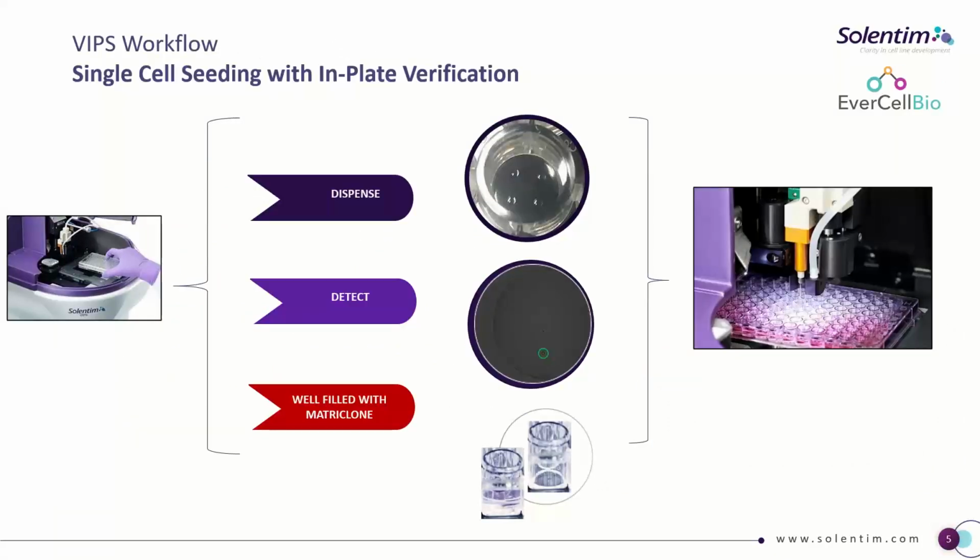So this is now the workflow using the VIPS. So what we're doing first is, just up here at the top with the laser pointer, we actually dispense the cell droplets into a dry well, and we do a sort of array format whereby we start off, for instance, in this position here, and we put down a 20 nanoliter droplet, and then we immediately image that droplet using the Z-stack imaging to see if there's a cell in it or not. And that's a droplet image you're seeing below. If we've got detection of a cell, there it is in the droplet.